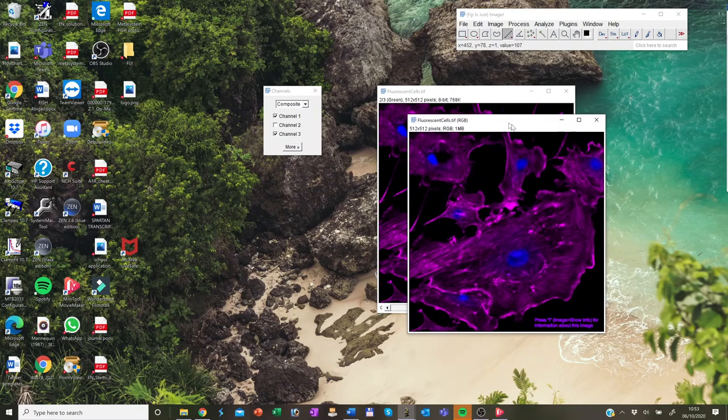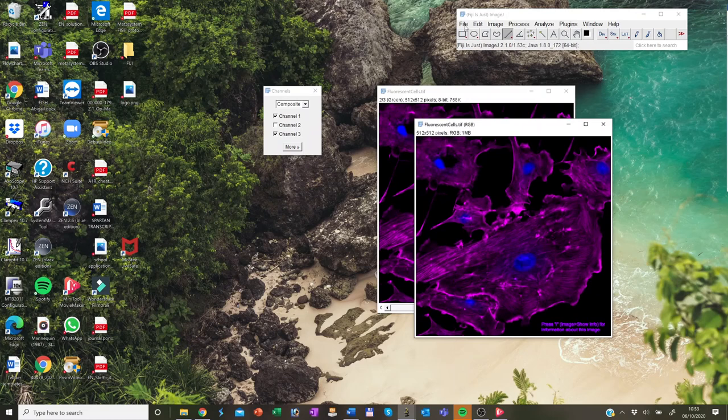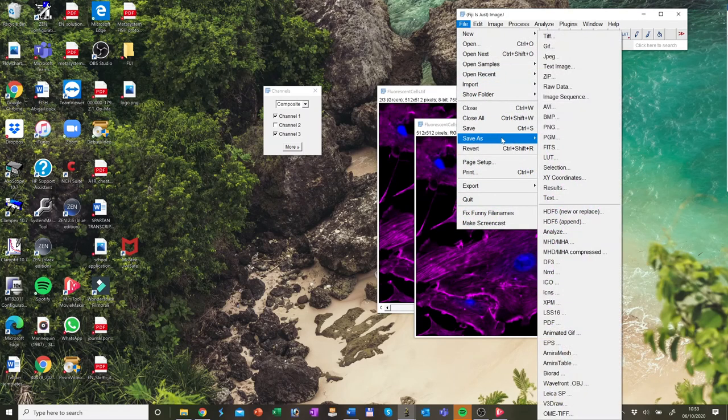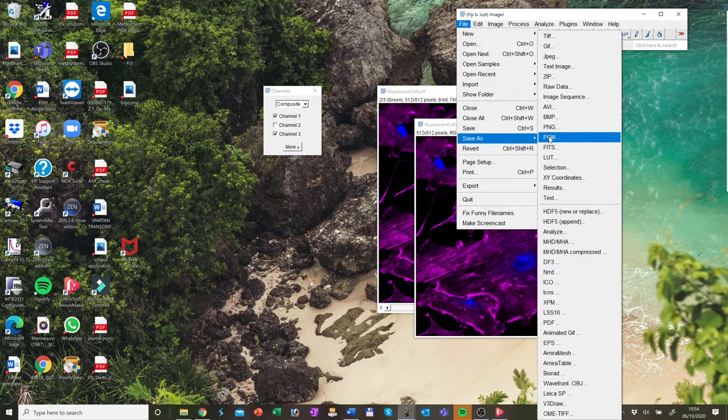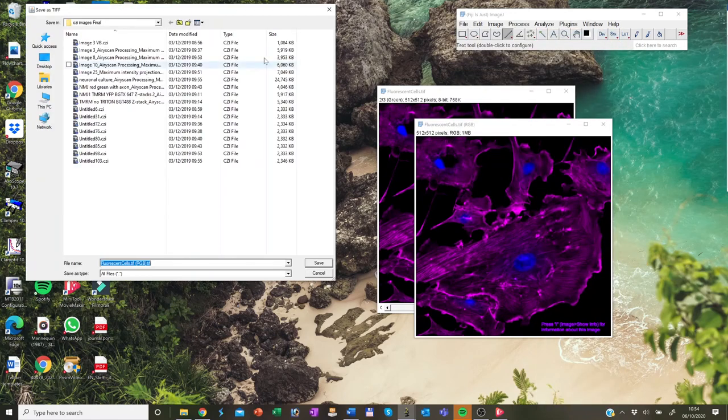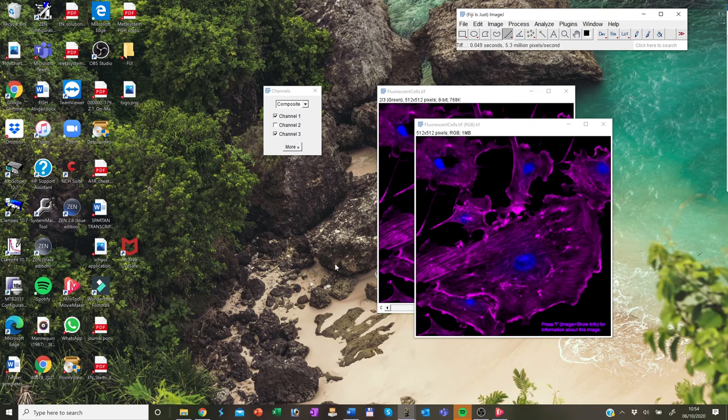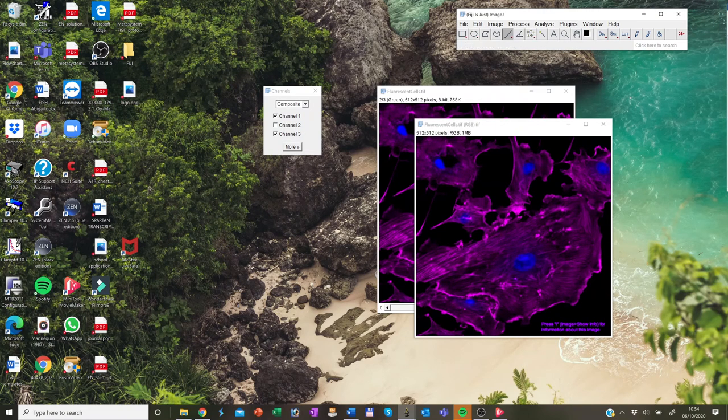So for this, I need to save that and I go on file, save as and I save it as TIFF as it should be. I'll save that. And you have to use this file for presentation purposes.